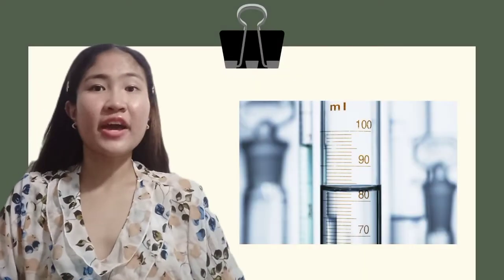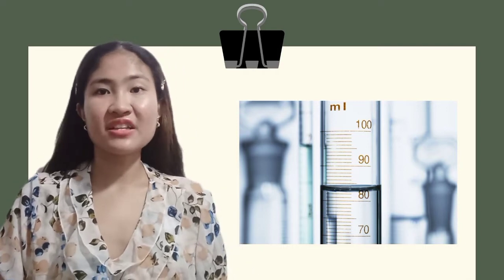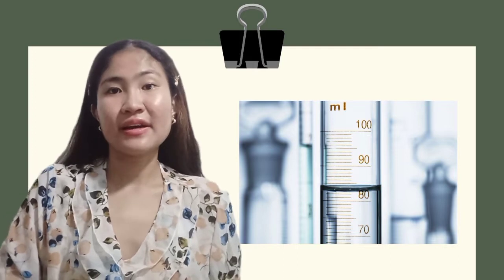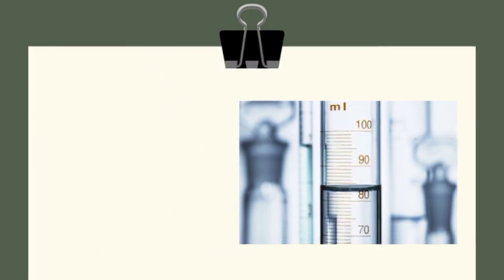The meniscus describes the surface of the liquid in the burette. Aqueous solutions wet glass, so the meniscus of an aqueous solution is always concave. The position of the bottom of the meniscus is read and recorded.